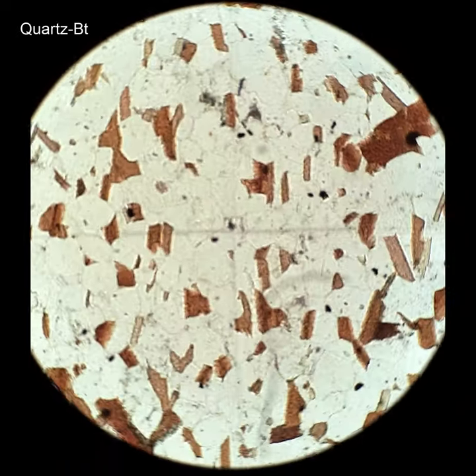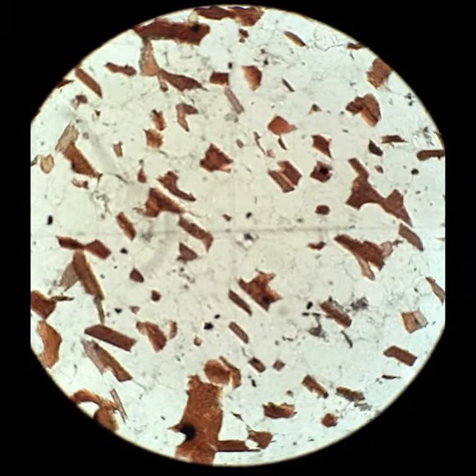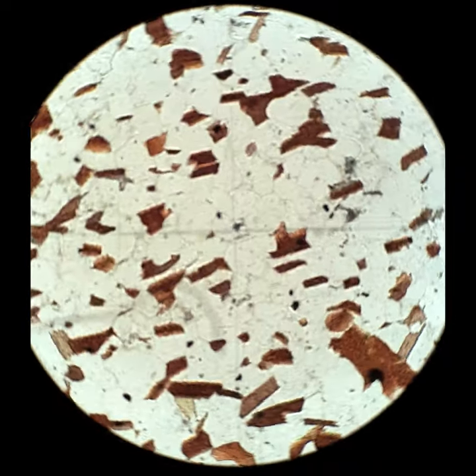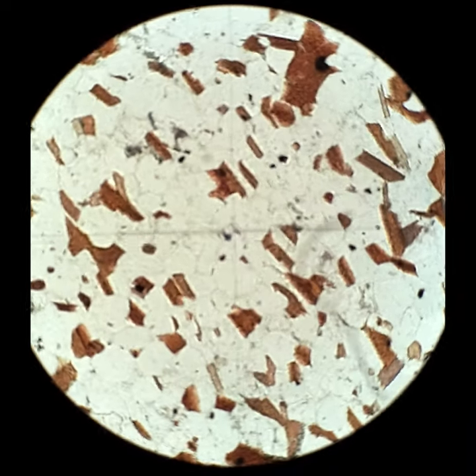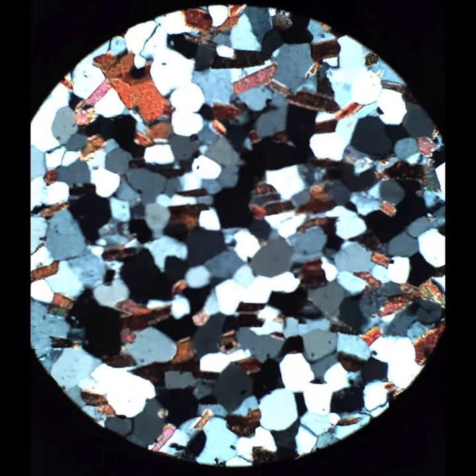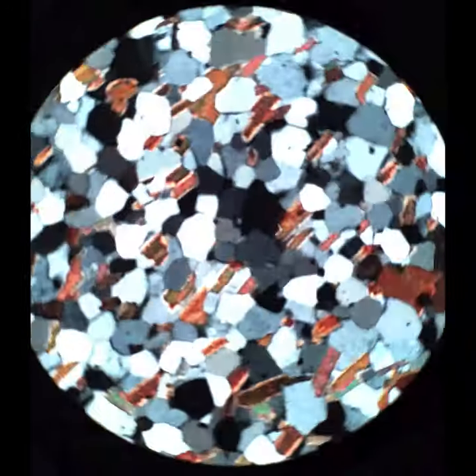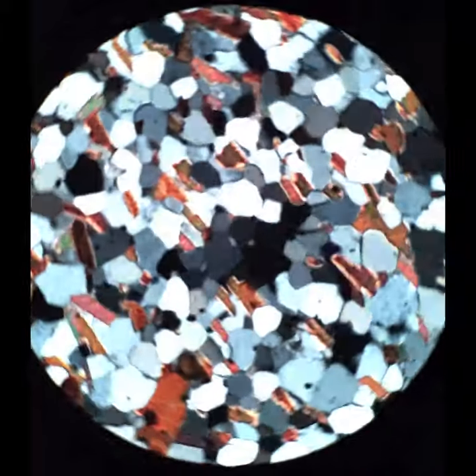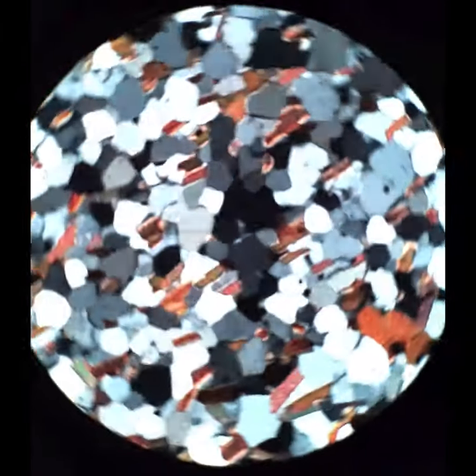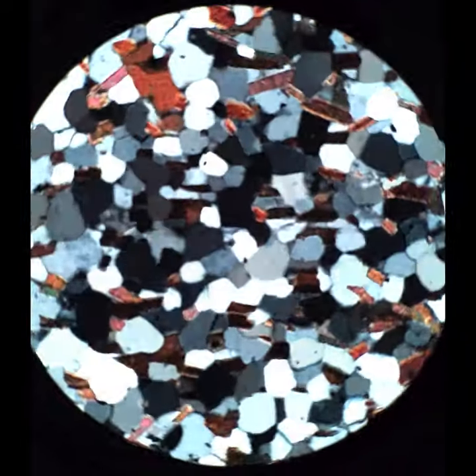Here's another quartzite. This one just has a lot of different grains, and you'll see that there are numerous grains in different orientations, but there are a couple that are also black in cross polars all the time. Again, it's simply because of an idiosyncratic orientation — the c-axis is almost perpendicular to the plane of the section. Most of them just show the normal black and white interference colors.